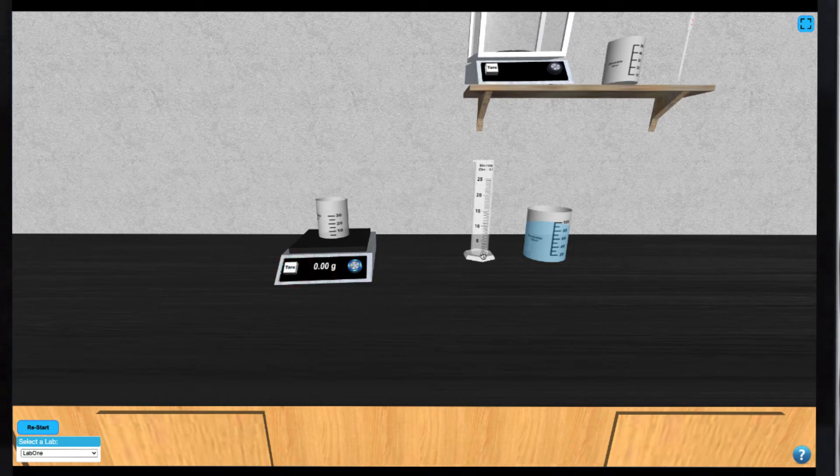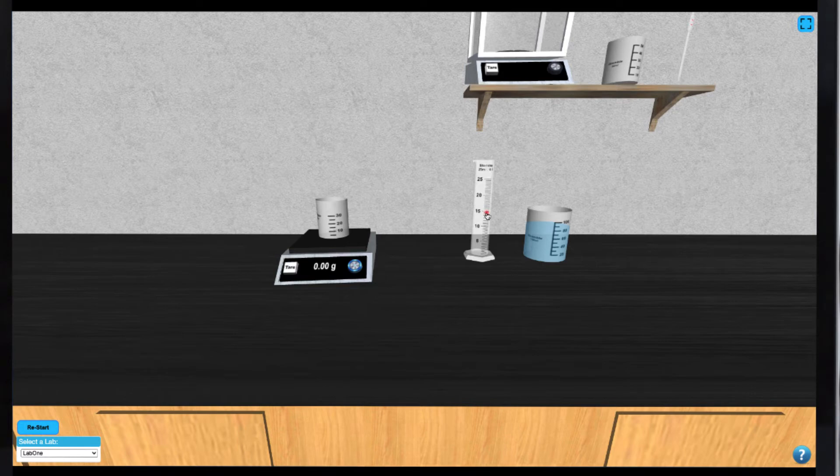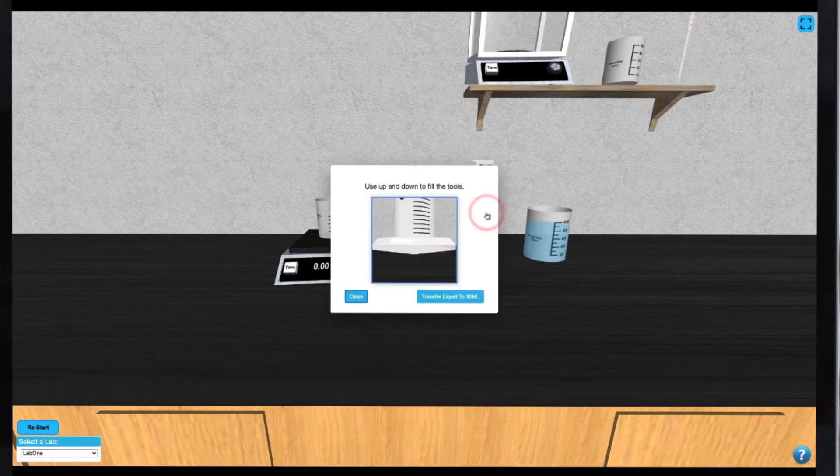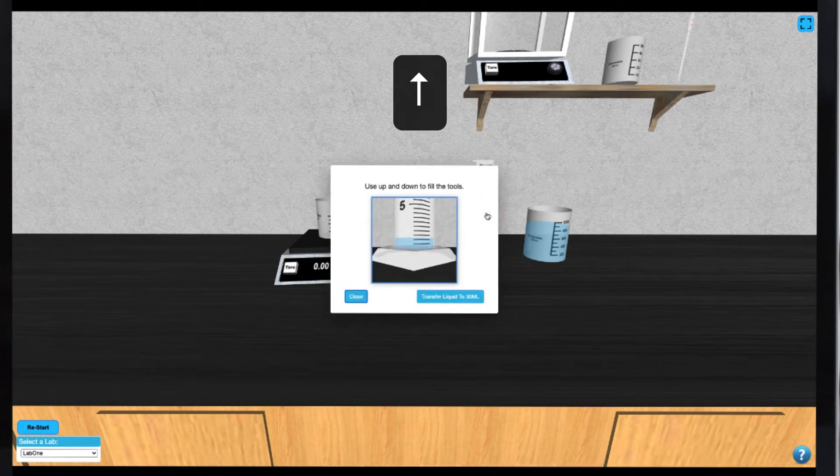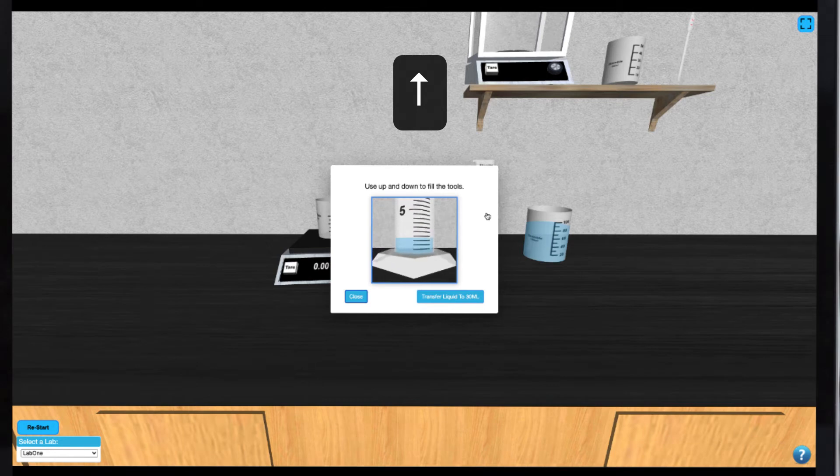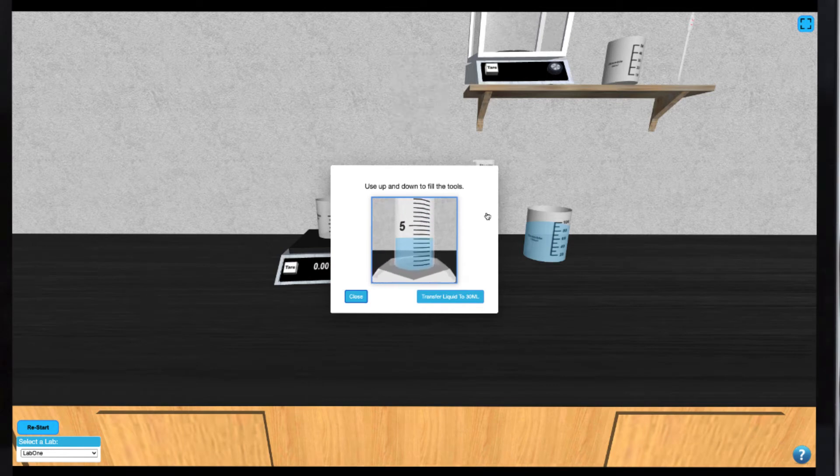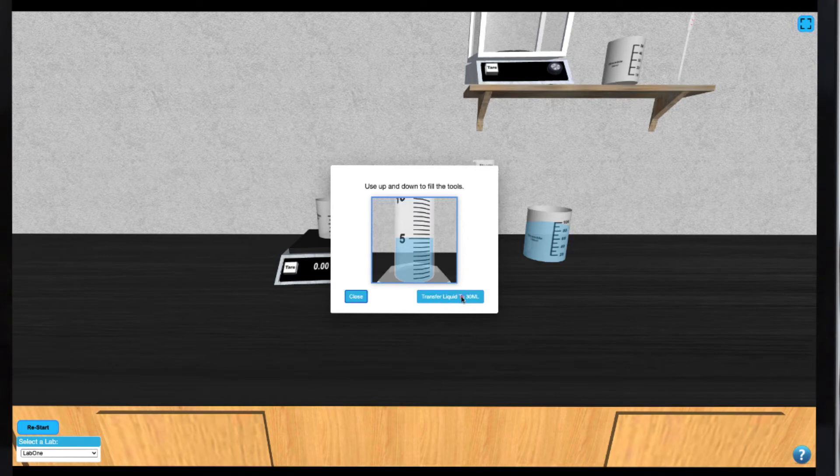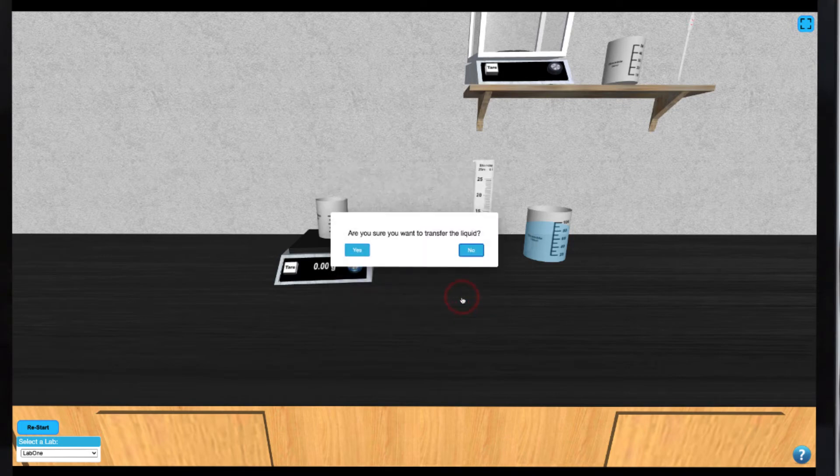Now you can select the glassware you'd like to use to measure your volume and press the up arrow to draw up the water. When satisfied with the amount of water you've drawn, you can transfer the liquid to your 30 mL beaker and weigh your sample.